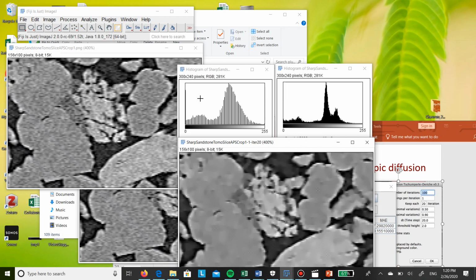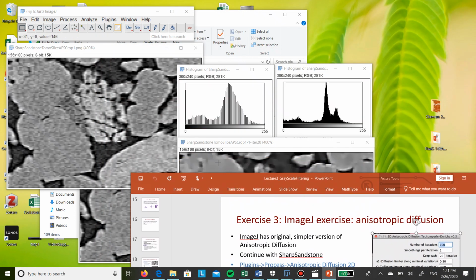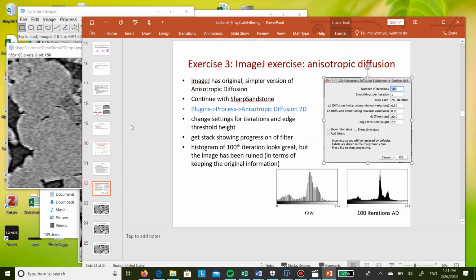Okay. So now that seems to have appeared as a, no, wait, the majority of stuff is this, so that's that. This phase might be this. So these greens possibly have slightly different mineral composition. So I am happier here compared to the median filter. I'm happier with how this type of smoothing works. I would just say that this went slightly too far, so I would probably do a lesser number of steps.